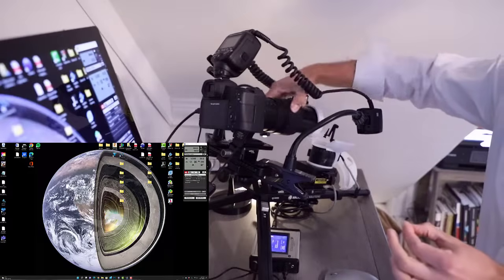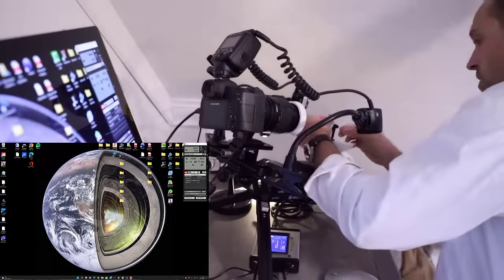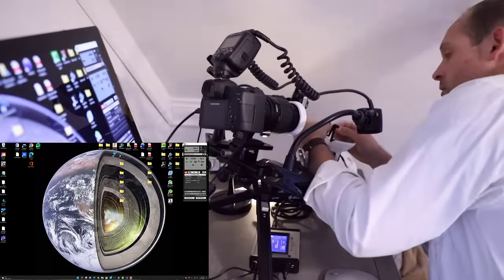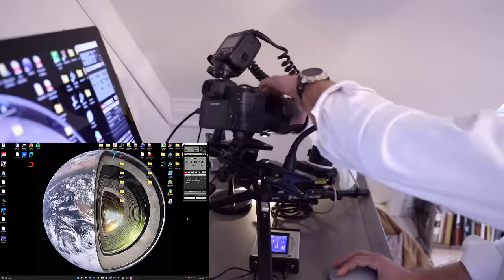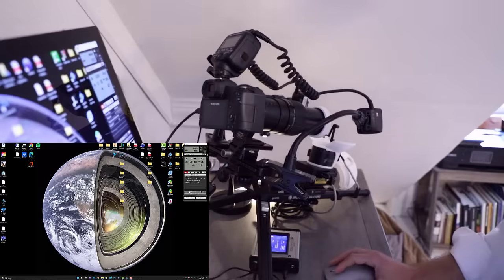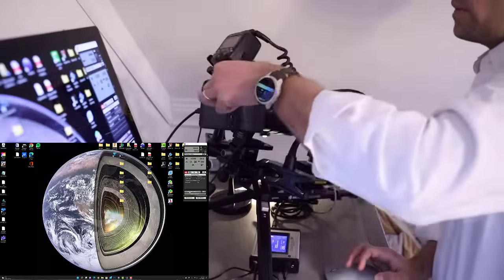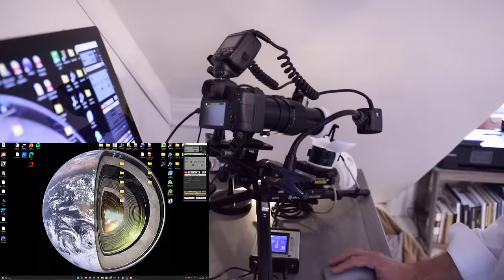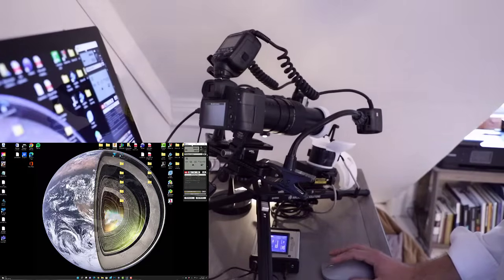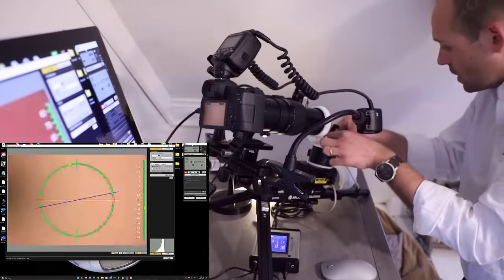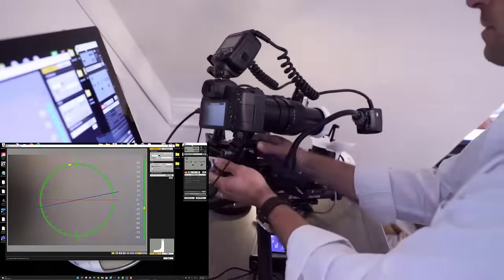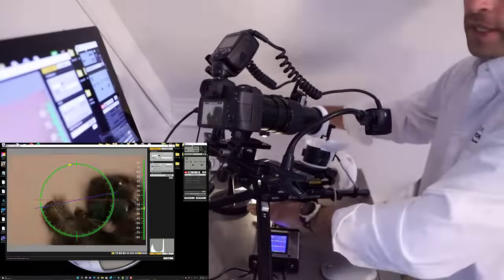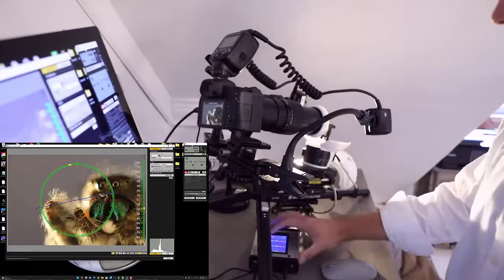First thing I'm going to do is take the camera back to 1x magnification and we're going to mount the specimen onto the universal stage. Once the pin is settled, now we just want to manipulate it a bit to try and get everything symmetrical and nice and square for a nice headshot. We're going to turn our flash off, take our camera out of manual mode and set it to automatic mode, and open up our live view shoot window.